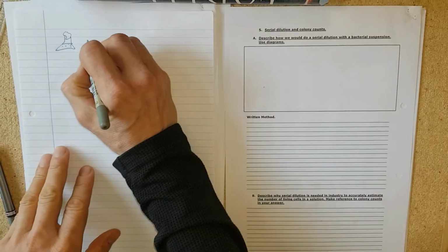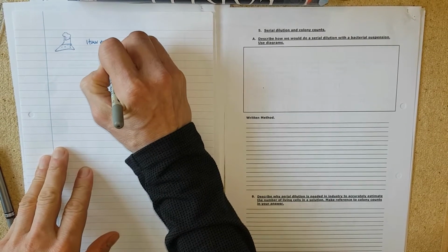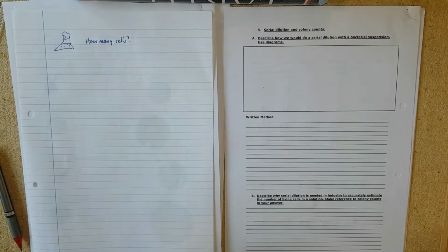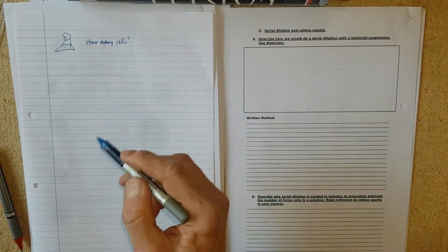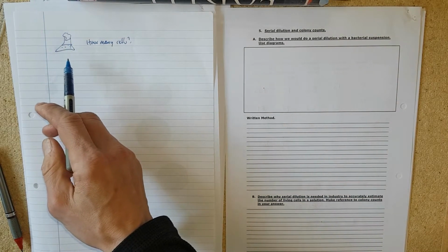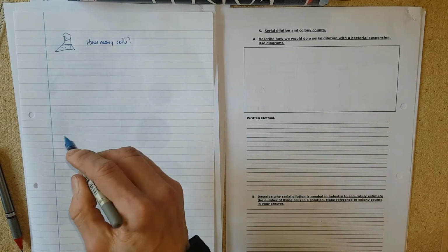So the question is, how many cells? What we could do is put a sample like you did and make a plate and see how many colonies form. And there's a slight problem with that.